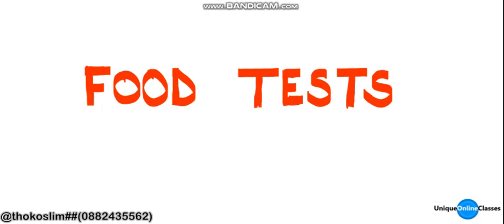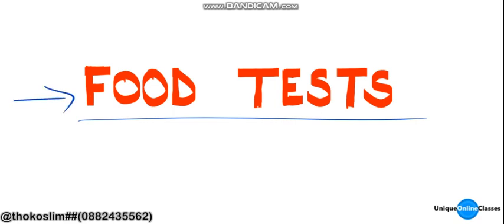In your final exams or terminal tests and the like, you may be asked in practical biology, given a sample, given materials to test the presence or the absence of a particular food substance. Or else you can be asked in agriculture theory, that's an essay, to describe an experiment of how you can find the presence or absence of a particular food substance. So this video we will discuss some of the tests which are conducted to determine the presence or absence of particular food substances. So let's now be together.